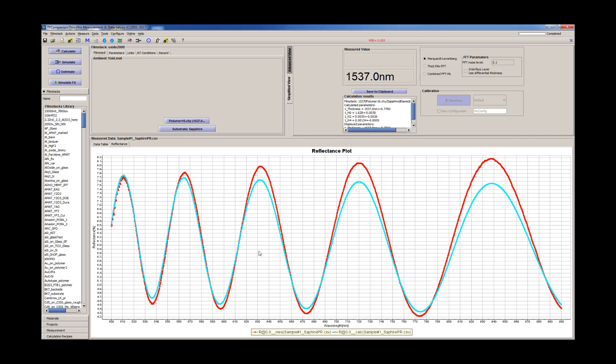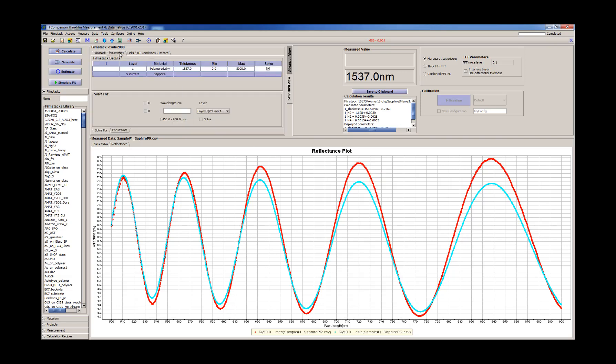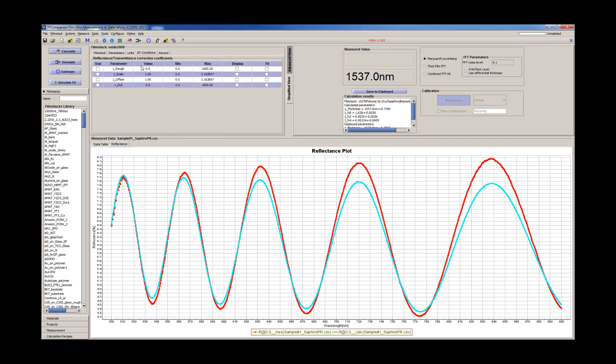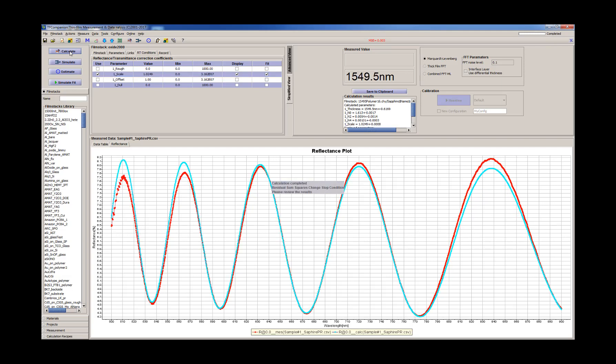Now it's lined up, the measured and model data. But we see there is still discrepancy between these two. So we need to adjust the scale. Scale is taking care of differences in intensity, basically between calibration and measurement, and also any changes in intensity of the light source.